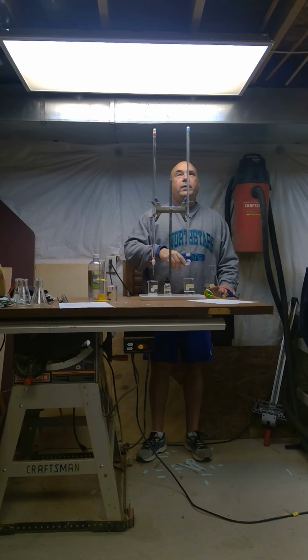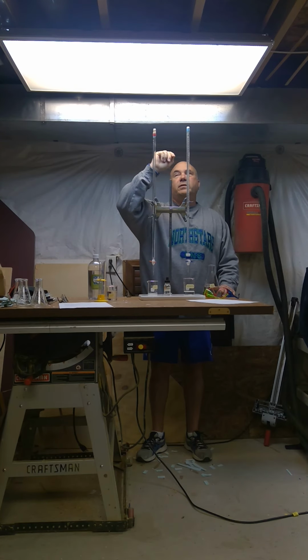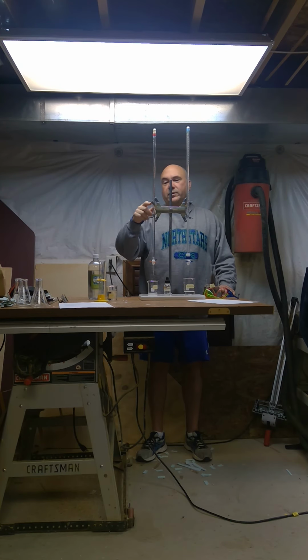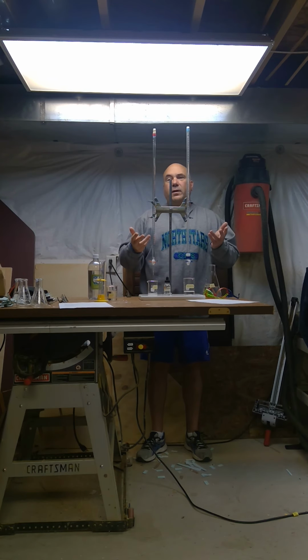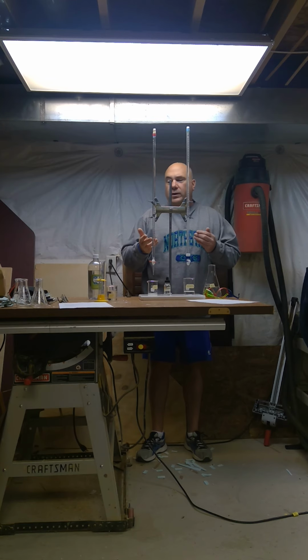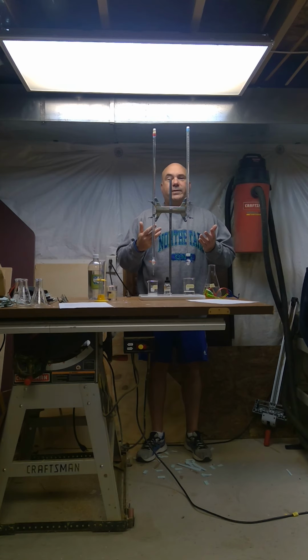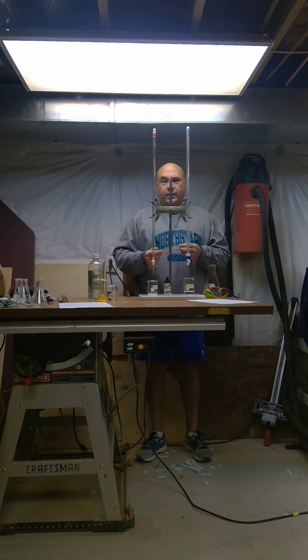Okay. Now, to load the burettes, the 0 is on top, 50 is on the bottom. For the sodium hydroxide, I filled it all the way up to the 0 point. Now, there is a meniscus, so you read the burette at the bottom of the meniscus. Now, for the vinegar, I only filled it up to 30 milliliters because we only need 2 milliliters per trial. So instead of filling it all the way up, I just filled it up to 30. All right, so we're going to start at 30. In reality, it doesn't matter where you start. It's how much you use. So if you look at the data table, you have an initial reading and a final reading, and then you subtract to get your volume used. So we're really set to do this titration.